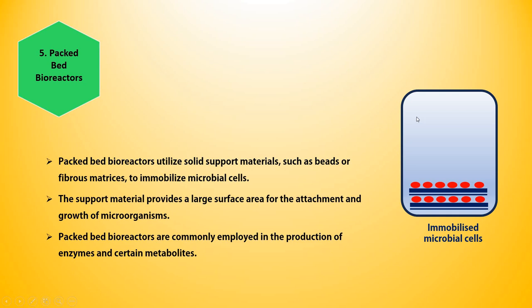Where are packed bed bioreactors used? They are principally used in the production of enzymes, because enzymes are very liable to destruction. If we use normal bioreactors where the products and microbial cells are mixed with one another, then during the recovery stage it will undergo a long processing, because we need to separate the microbial cells from the product.